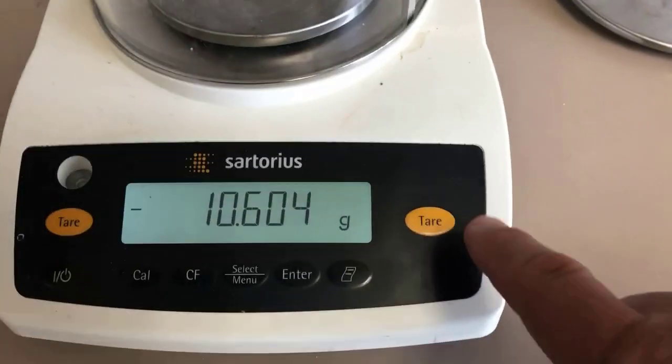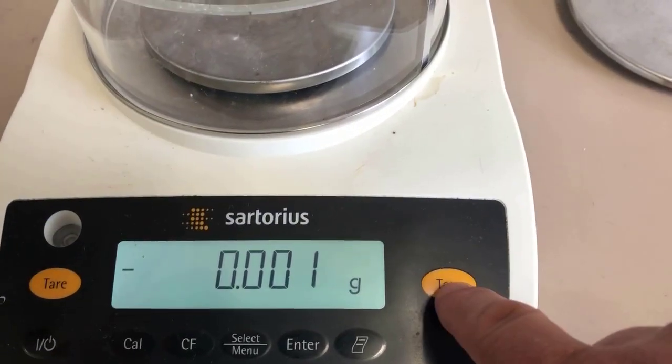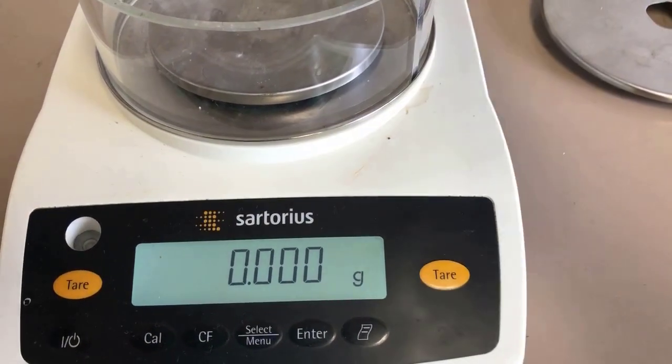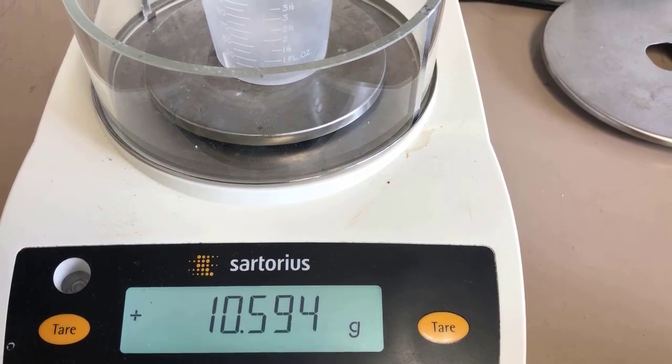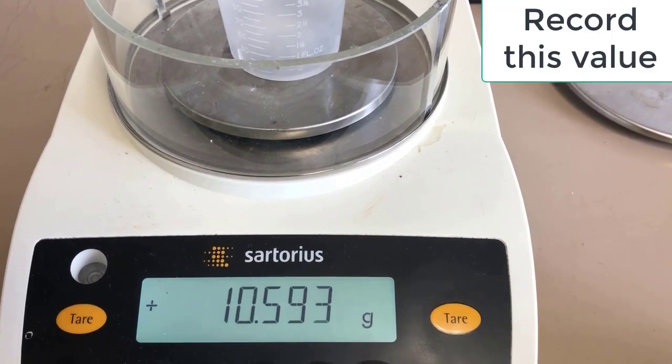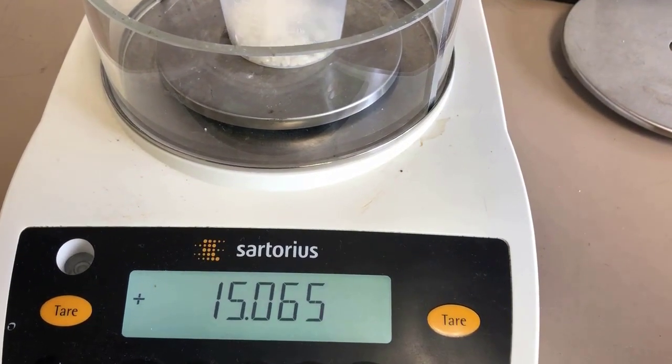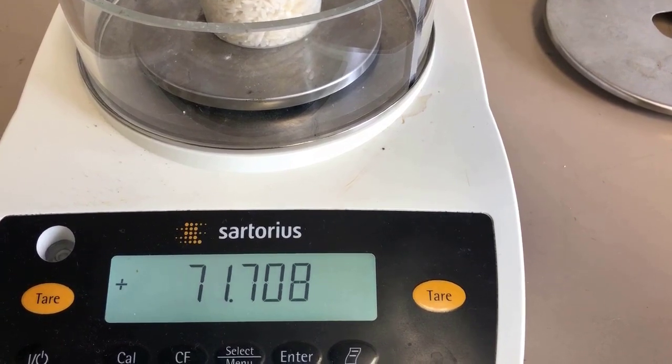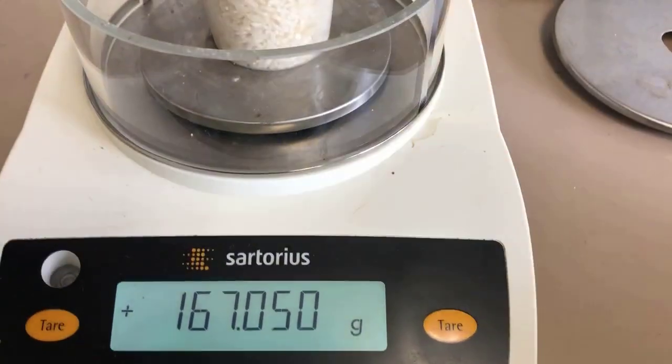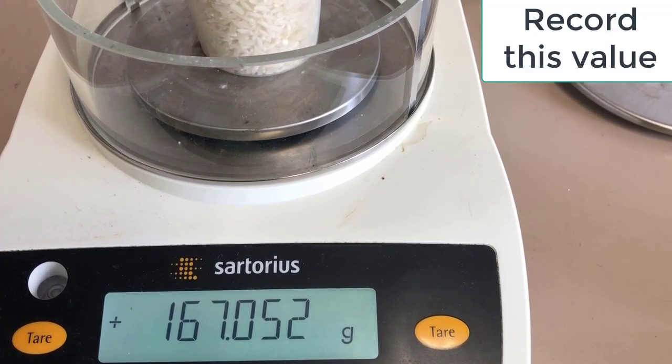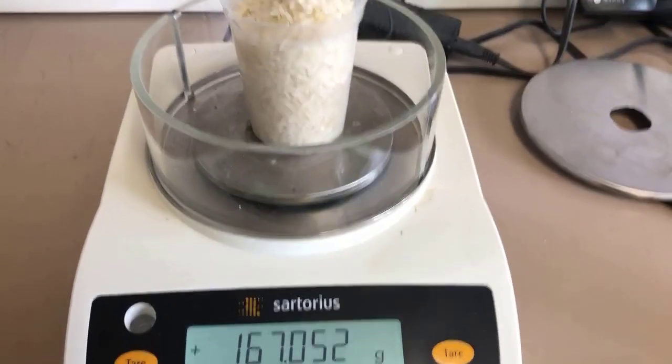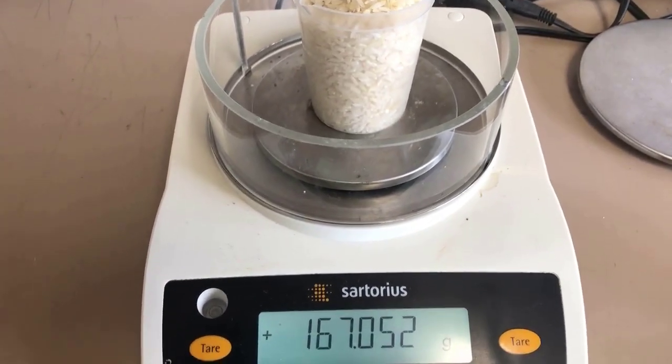So we're here at the balance and we will tare it out. Make sure it gets a zero on it. Put the cup on there. Now you have the mass of the cup. And then I'll add the rice to it slowly. And that's your mass of your rice in the cup. So again, you'll get the mass of rice by subtraction.